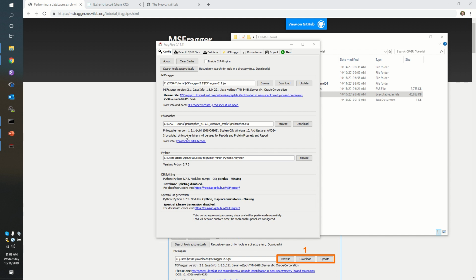There we go. One of the things that should happen immediately when you launch FragPipe is that it's going to sniff your computer, like a little dog. But the goal here is that FragPipe knows that it itself doesn't do a whole lot of interesting stuff. I mean no insults to the people who created it. This is designed as a GUI. It's a wrapper. So the software is making it easy for us to use MSFragger. It's making it easy for us to use Philosopher. But the tools that it's calling are not part of FragPipe itself. It's just calling those externally.